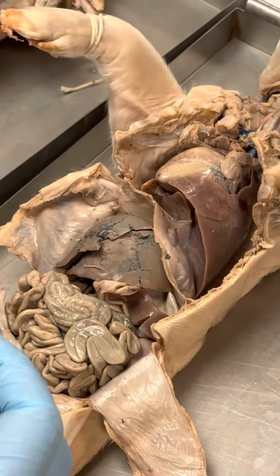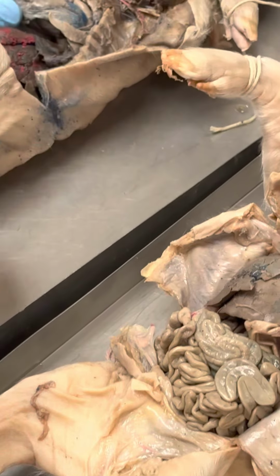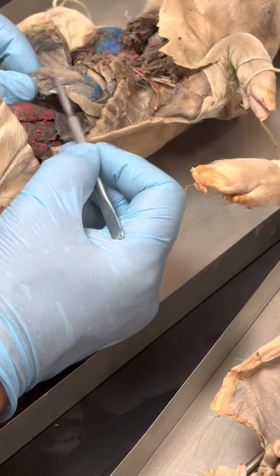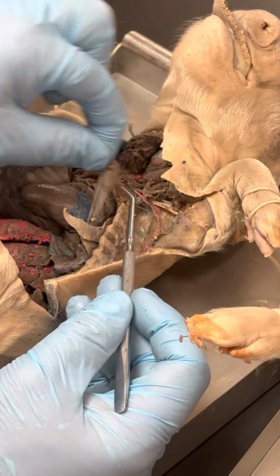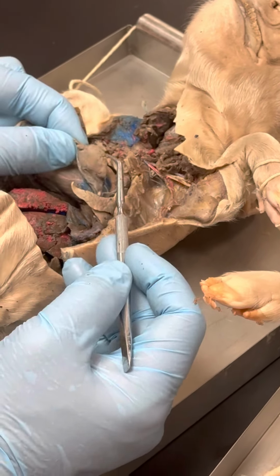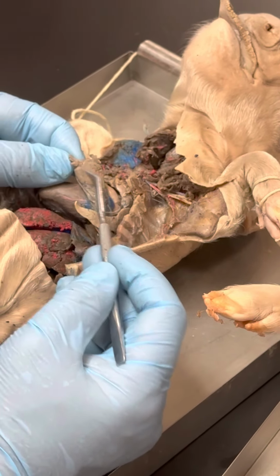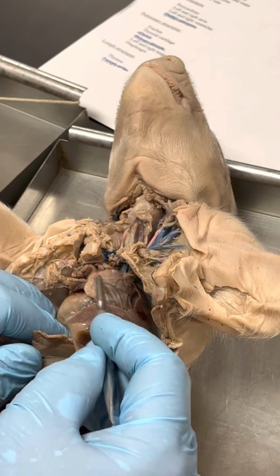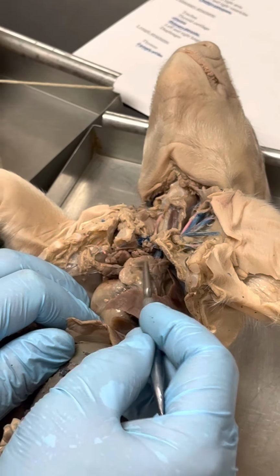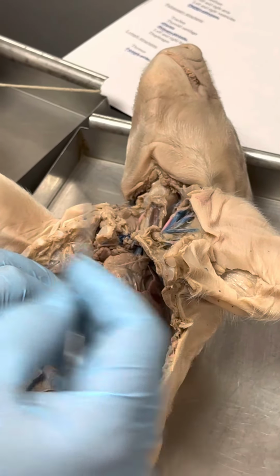So we'll go back to that pericardial sac, and that glandular tissue around that pericardial sac is your thymus. So if you lift up, it kind of looks like an atria as well, but the atrias aren't. That's a thymus. On this one, you can see nothing but thymus, because that pericardial sac is mostly ripped off. So there's thymus.